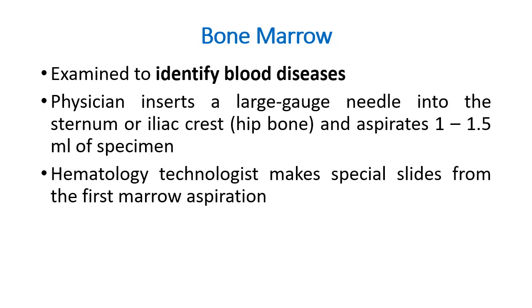Bone marrow, it is used to identify blood diseases. So the physician inserts a large gauge needle into the sternum or the iliac crest sa hip bone and aspirates 1 to 1.5 ml of specimen.